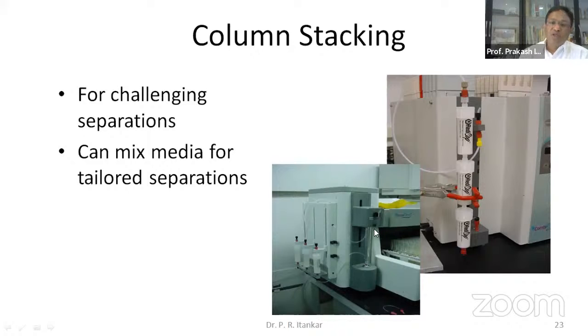Now, this is needed if your sample quantity to be taken for separation is quite big. Say, if you are willing to have 100 grams of sample for separation, then in that case, as I was telling you, this particular machine, which is made for laboratory and R&D purposes, can cater only up to a maximum of 33 grams of sample. So if you wish to have 100 grams of sample separated at one go, then either you can go this way, stacking, or you can have the system in parallel.